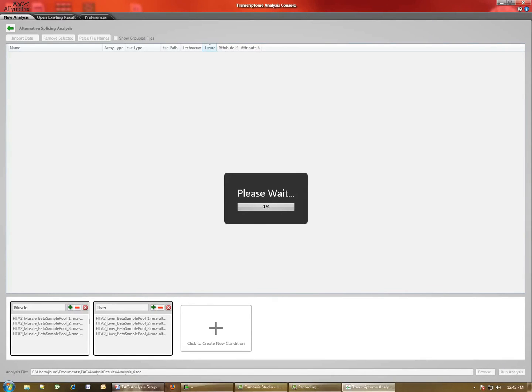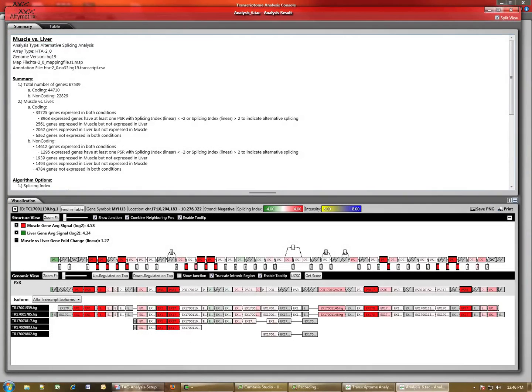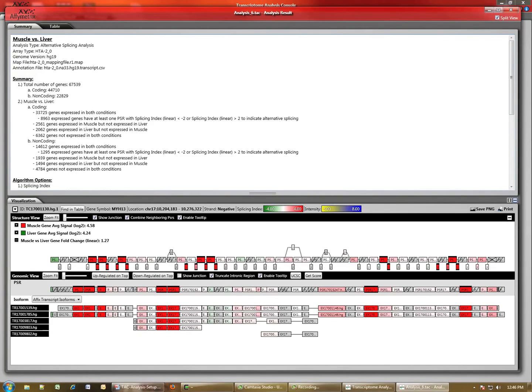The analysis will proceed, and when it is complete, the results will be displayed. After the analysis is completed, the results table will be displayed. In this case, we have the summary table at the top and the transcriptome analysis visualization displayed at the bottom.